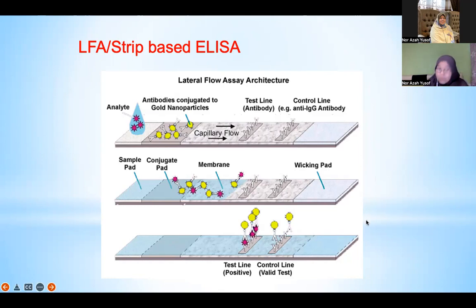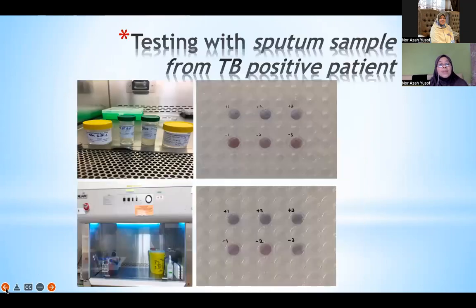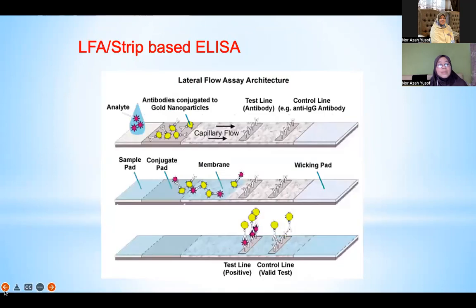You can directly use urine. But unfortunately, if we use a blood sample, because it is based on color, you will observe the purple color, and blood might interfere with the color. So it has to be filtered first before you can use this kind of detection scheme. So apart from the test strip, okay, this one is the test strip.